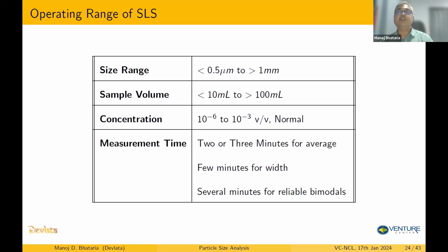That is the issue. So you need to have a good sample agitator and a flow-through cell for having the complete size range. If you're using a static cell, not a flow-through cell, then your sample volume could be lower. But if you're using a sample agitator and a flow-through cell, you'd require a slightly higher sample volume.